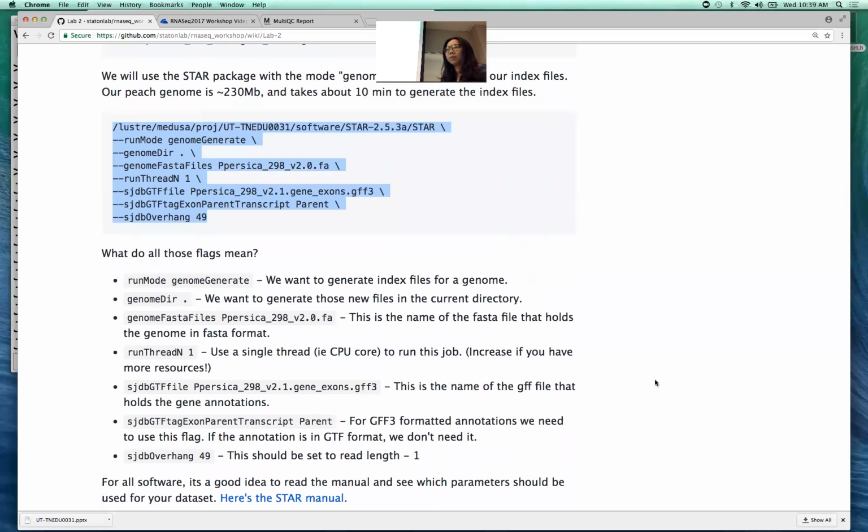Words, let's say, just by scrolling along, it searches everywhere. Just the next position. Yeah. So once it finds a word, it scrolls along and finds something that's the same. Yes. So it looks at all the different words and then it tries to map. And there's a variety of very smart algorithmic modifications that you can read about in the paper. There are over 100 different read mappers, and they all have their own special sauce that they use to speed things up and make it more accurate. But the general conceptual way it works is the same.